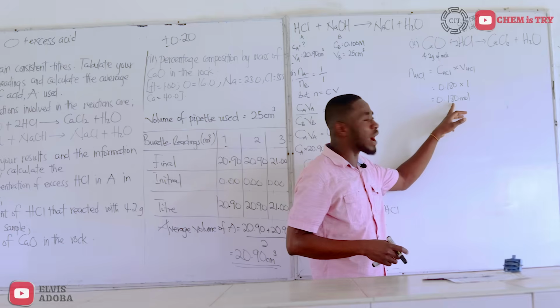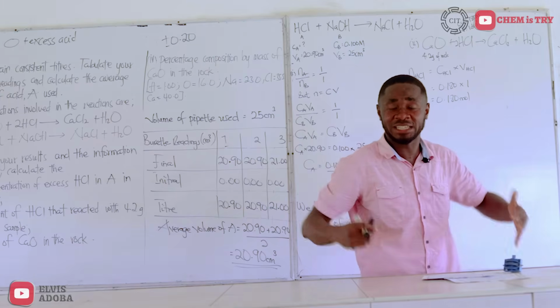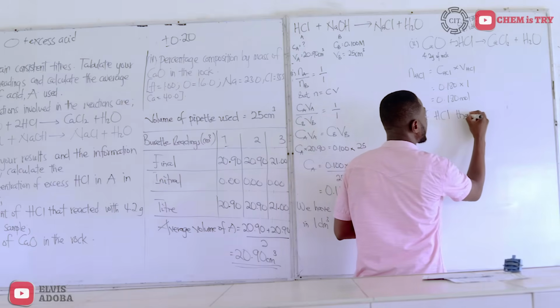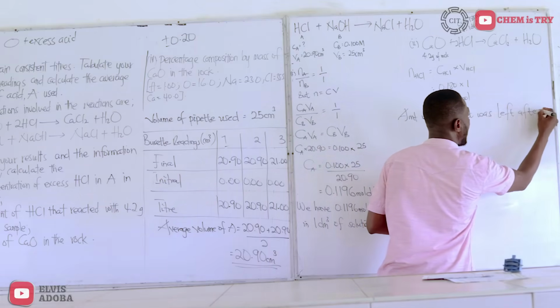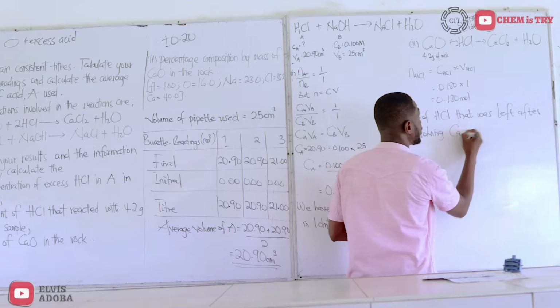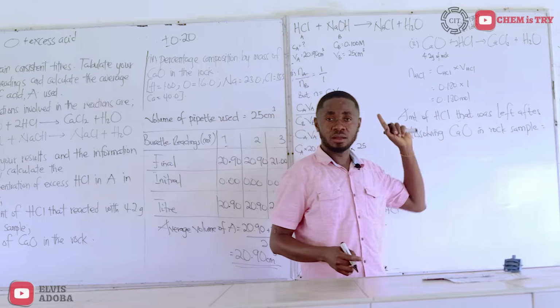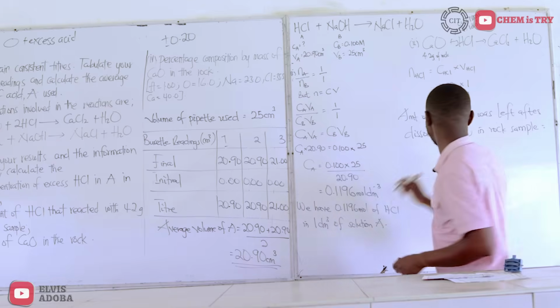Out of the 0.180 moles, some dissolved the calcium oxide, some didn't. The amount of HCl that was left after dissolving calcium oxide in the rock sample is what partook of the titration. And that gave us 0.1196 moles.